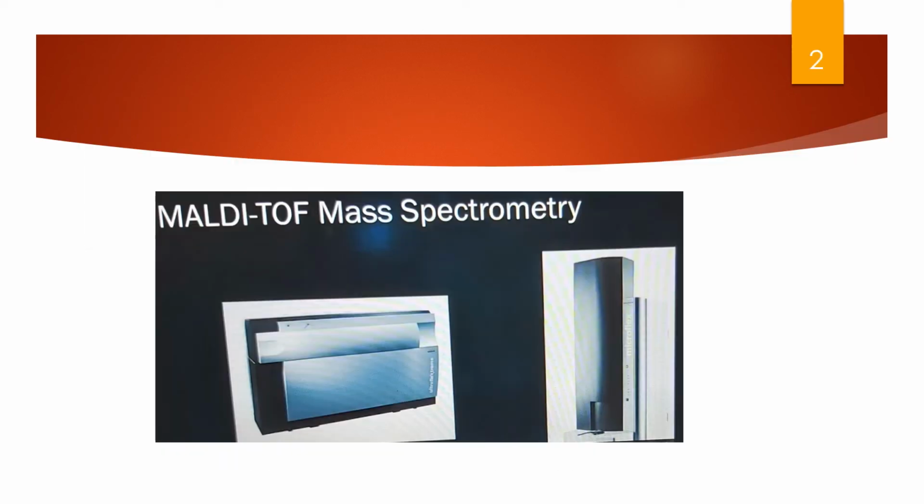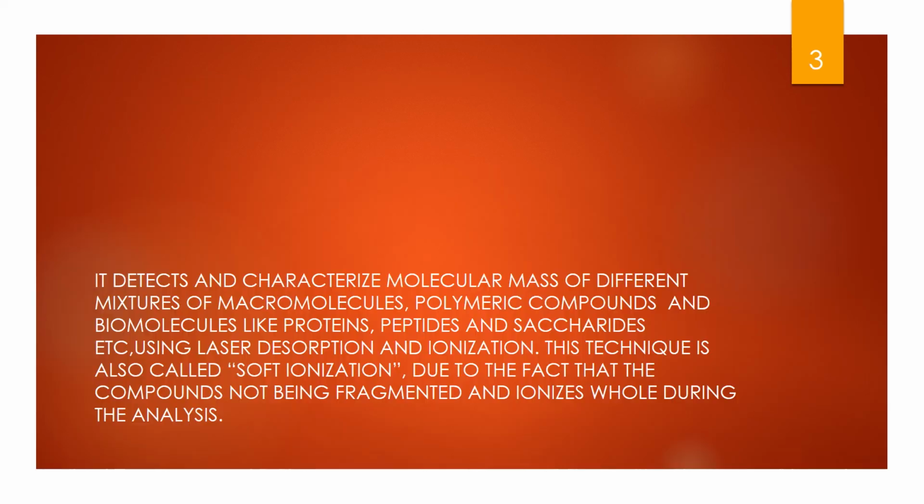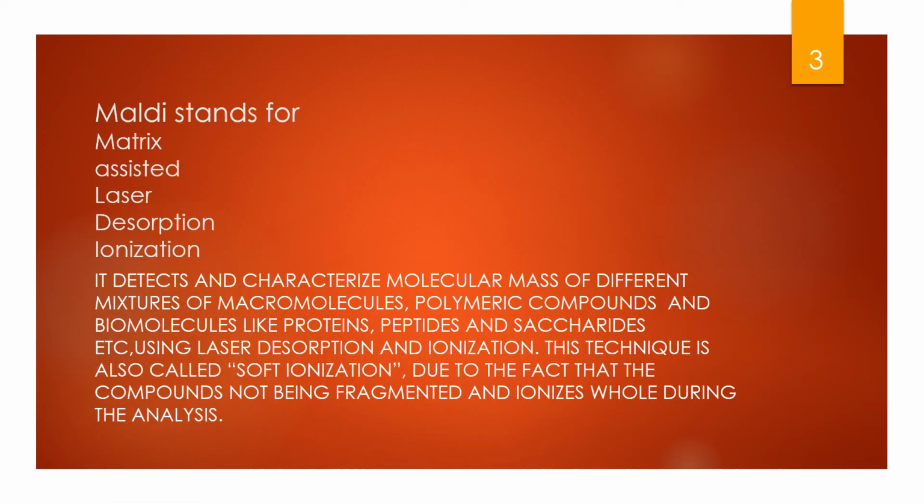This picture here shows how a MALDI-TOF instrument looks. MALDI-TOF mass spectrometry is an adaptable, multi-skill technique. MALDI stands for matrix-assisted laser desorption ionization.